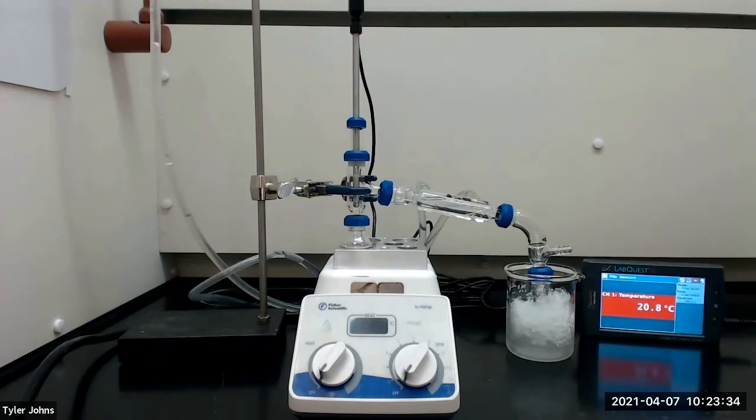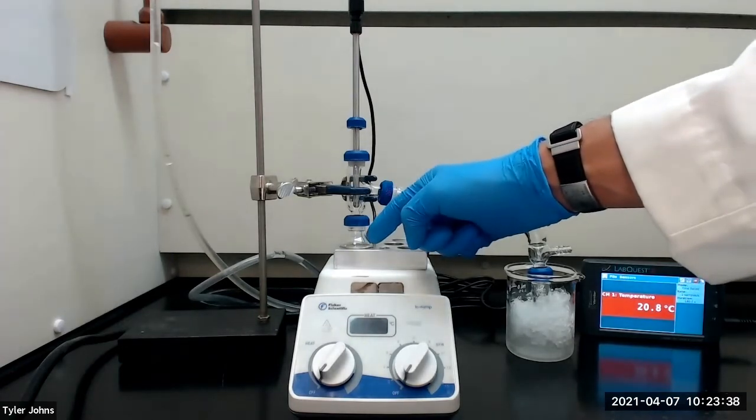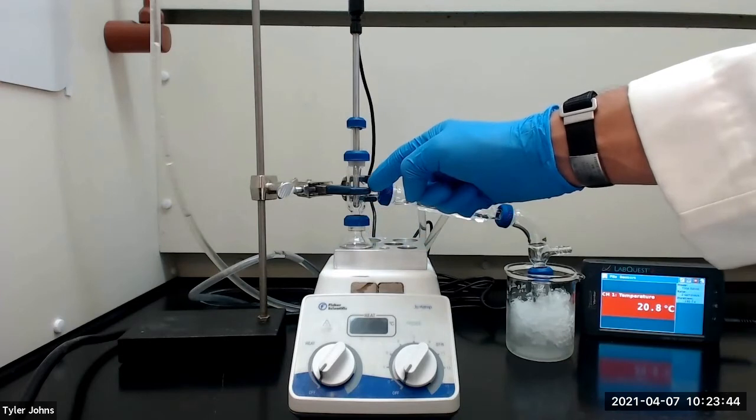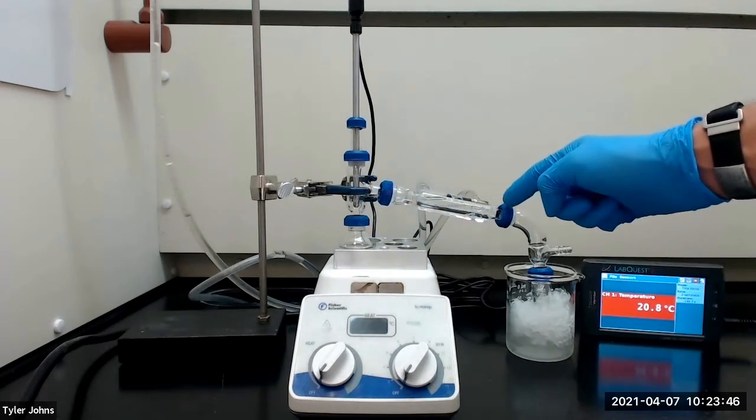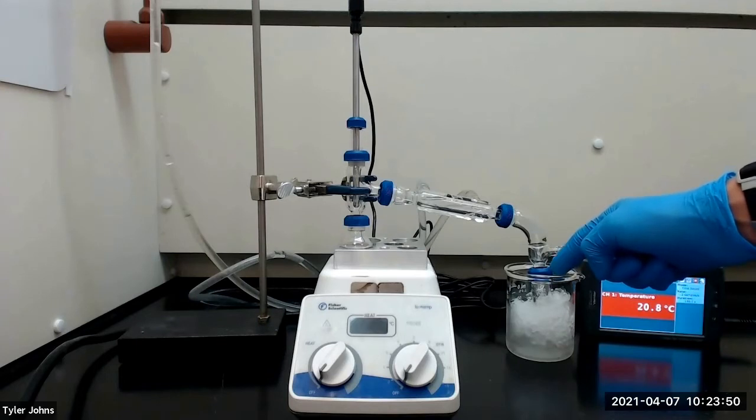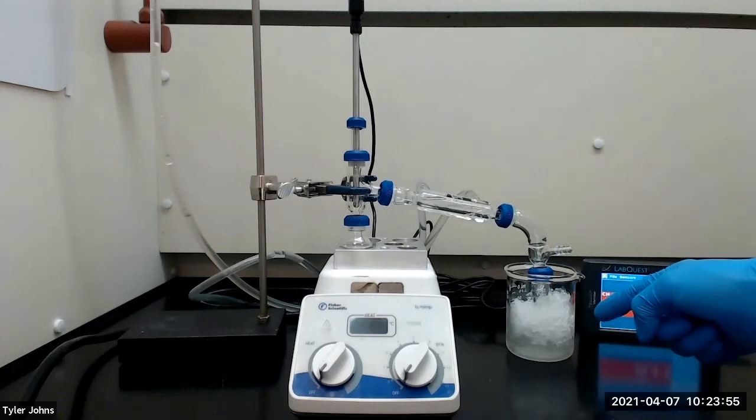We will next purify the ester by distillation. I have attached the 10 milliliter round bottom flask with the crude ester product to the distillation apparatus, which consists of a distillation head, a water-cooled condenser, a bent vacuum adapter, and we will collect the distillate in the pre-weighed 5 milliliter conical vial.